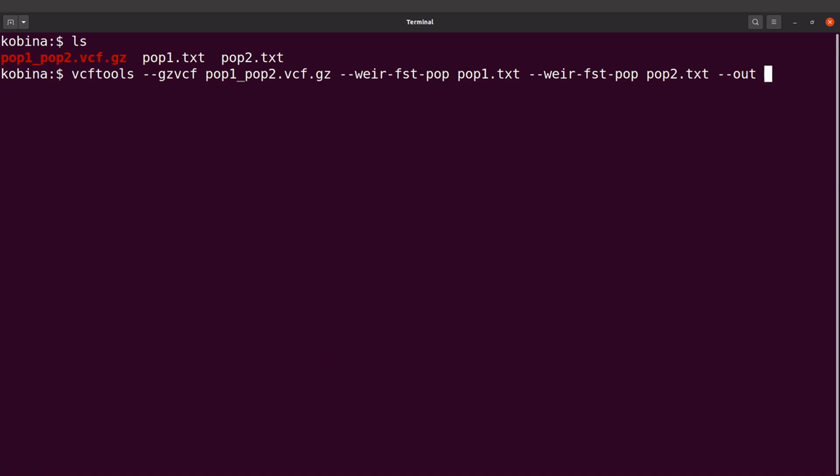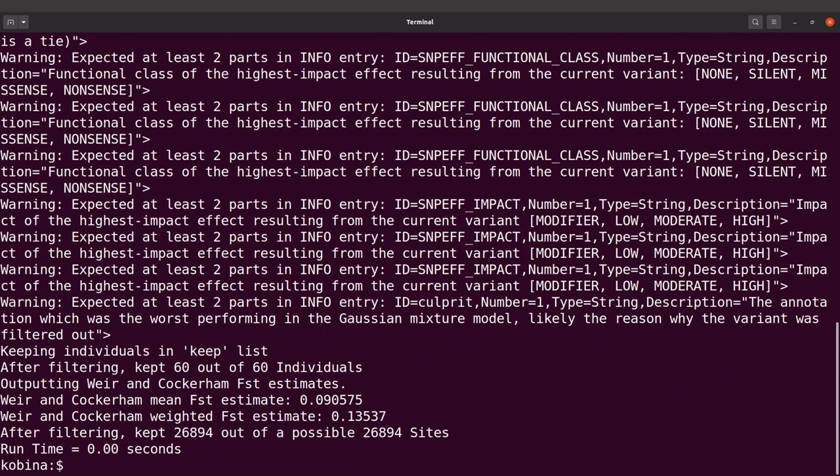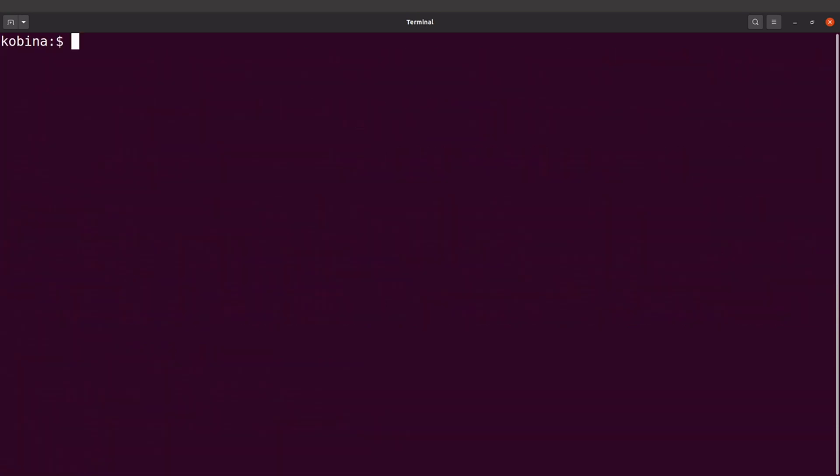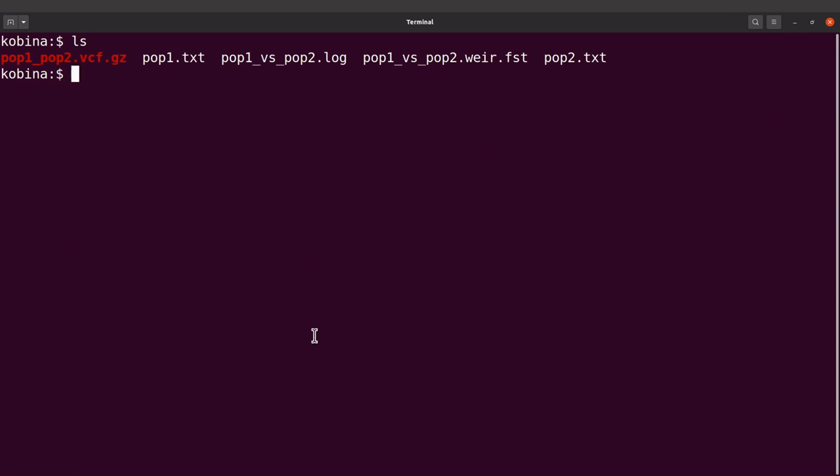pop1 file and pop2 file. And then I'll also give my output file, so that'll be --out and then I'll give the name that will be used. Okay, so this name will be the prefix for all files that will be generated. So I say pop1 versus pop2, that'll be the name. So I'll run this command. Perfect. Perfect, so everything has been done now. So let's check the files. Let's do an ls and you see some files generated.